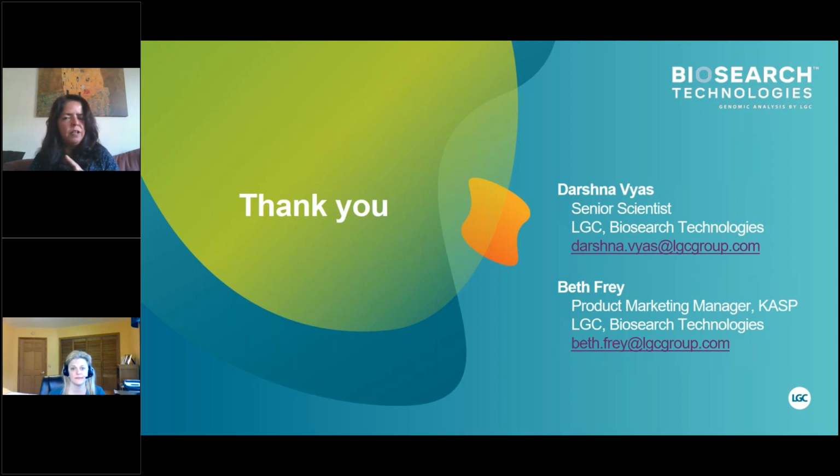But with KODs, we go through a full validation. We would need samples, a minimum of 22 samples. We go through a wet lab validation, which means that we will run the KASP markers on your samples to ensure they are optimized for your particular target. And this may involve some redesign. So generally, we will go through to the nth degree to try and get these KASP markers working for you.